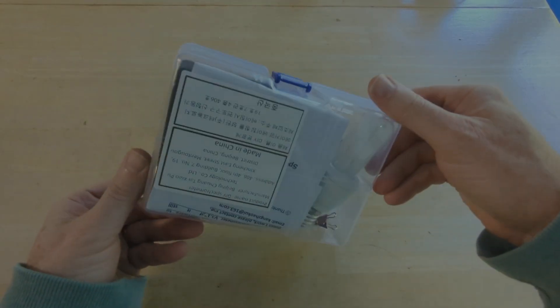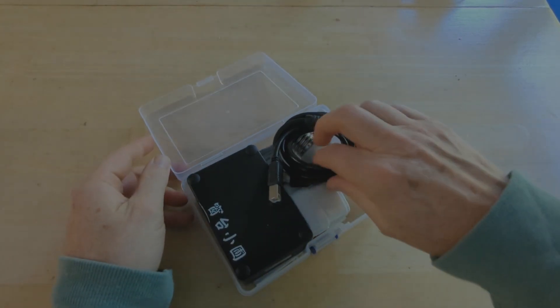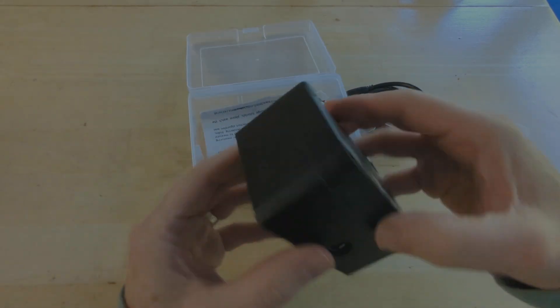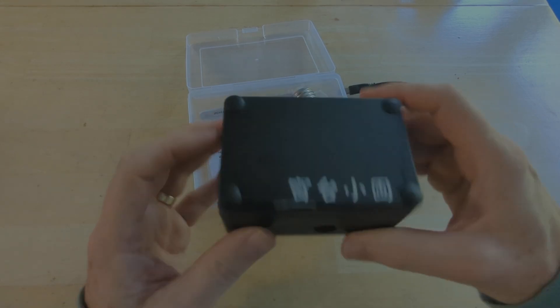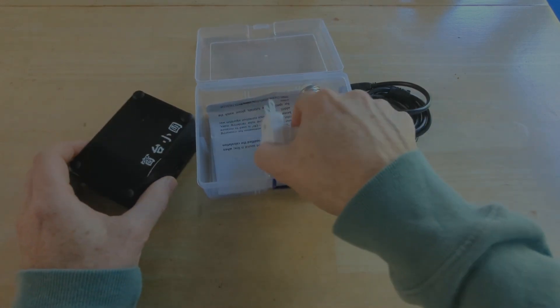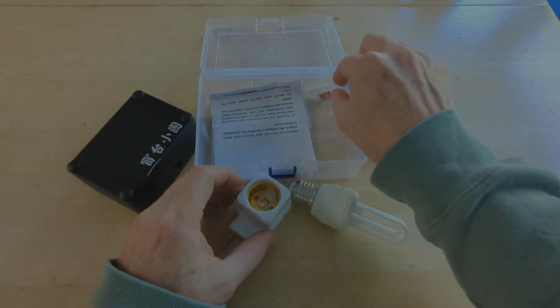I bought this inexpensive and really impressive spectrometer and wanted to document how to use it and how I use it to check the wavelength of my lasers, because it was tricky to get it working and calibrated. These instructions will be helpful for any of the super cheap DIY spectrometers anyone can make with a CD-ROM or with a diffraction grating and a web camera.